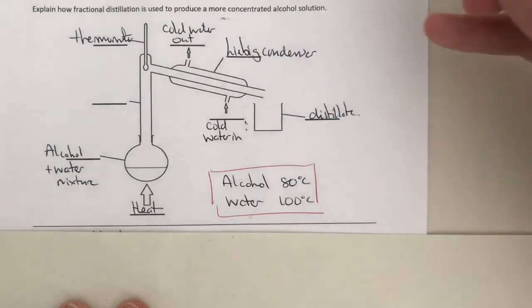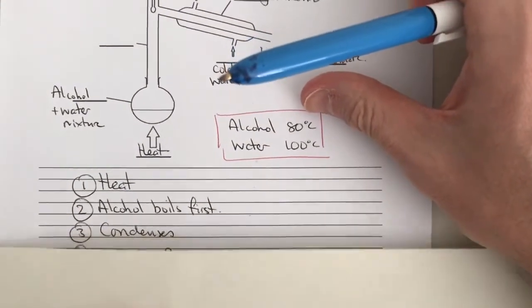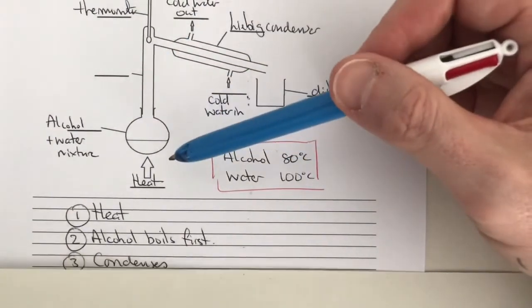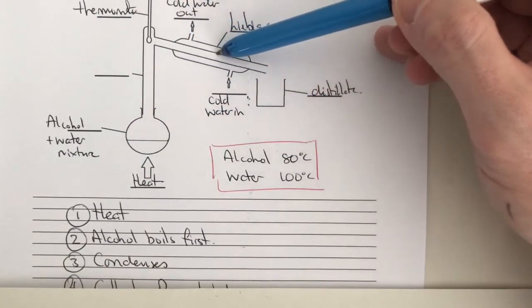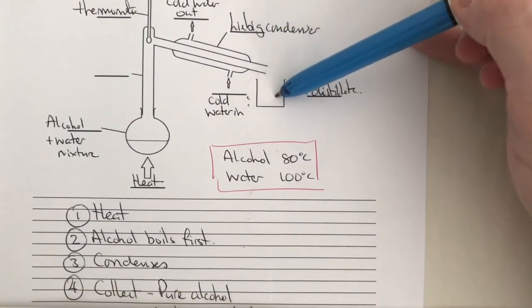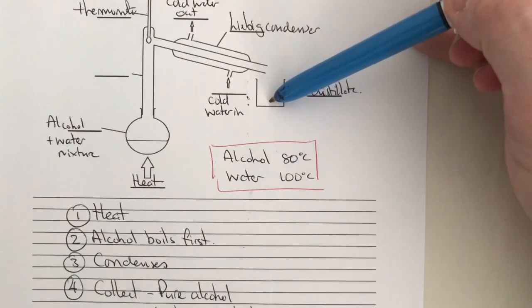So the steps involved are, we have to heat up the mixture. As we heat it up, we've already said the alcohol is going to boil first because its boiling point is slightly lower. As the alcohol starts to boil, we then need to condense it in the condenser, so it cools down and turns back into liquid alcohol. We then collect the alcohol, which will be pure alcohol at the end, and it will have a higher concentration, a greater amount of alcohol in there.